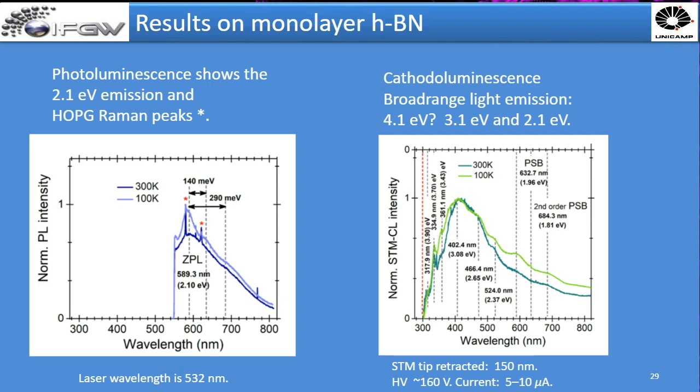So we think that within a few percent we should be correct in our collection efficiency, because otherwise the quantum yield of the gold surface would be offset with respect to the literature. So we have, on one hand, the modeling of the system, and on the other hand, this standard sample that shows us that we are collecting as much light as we think we are.